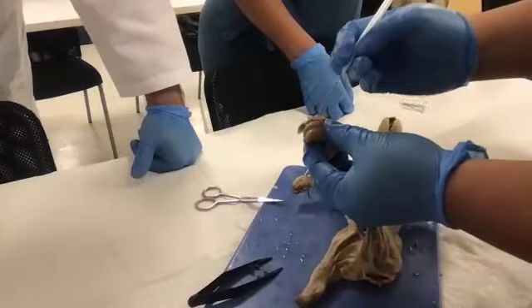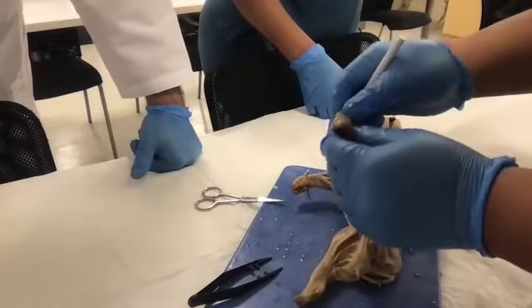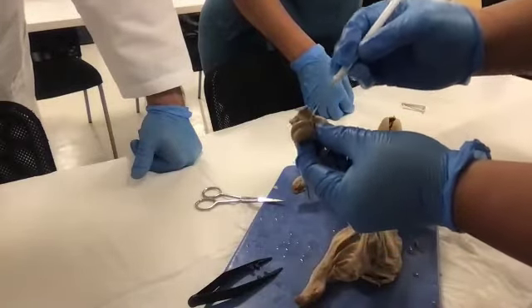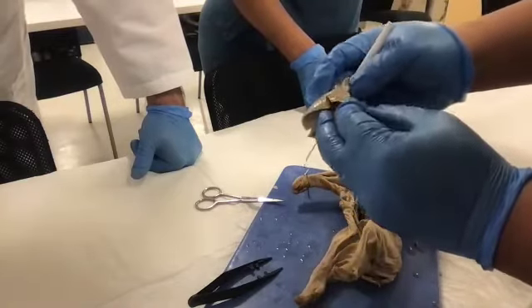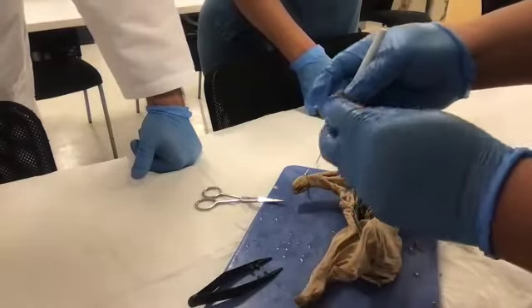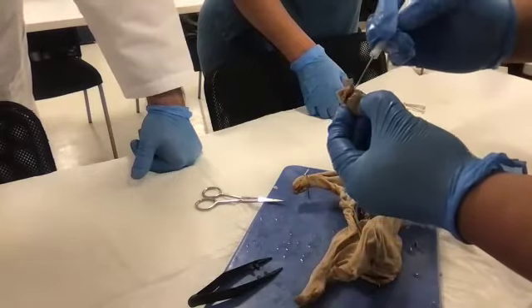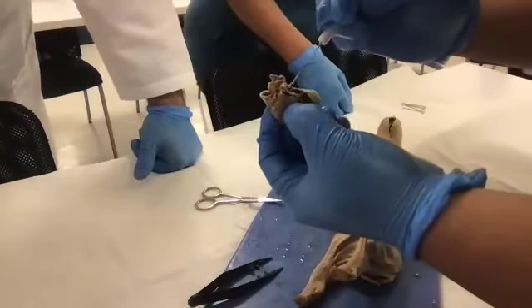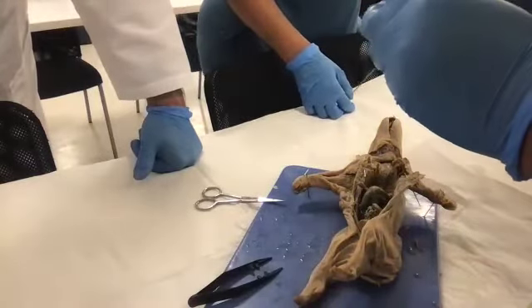But I know this is the front because when we took it out, that's the front. But isn't my interventricular sulcus going diagonally off my apex? Isn't my atria in the front? Oh, look. I have a covering right here. That's kind of tough. That's got to be my pericardium. And this has got to be my right ventricle, left ventricle. And this little flap here, that's got to be my right atrium. This little flap here, left atrium.